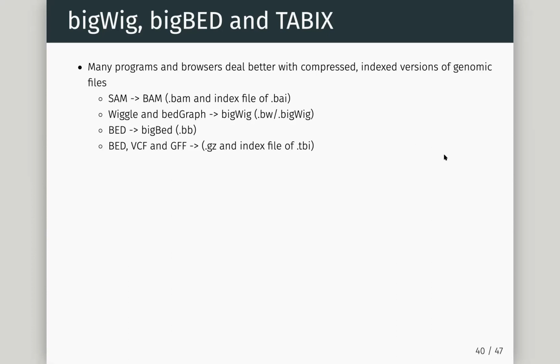You can easily save or make these files much more accessible to software. And using this in combination with something called indexing, we can access parts of these files without having to read the whole file. I can tell you some of these BAM files are hundreds of millions of reads long, some of the ones you will sequence as well. Reading 90 million reads to get to my 90 millionth and one read can be a real pain. So these formats allow us to deal with the data much more efficiently, and they allow the programs we use to deal with it.